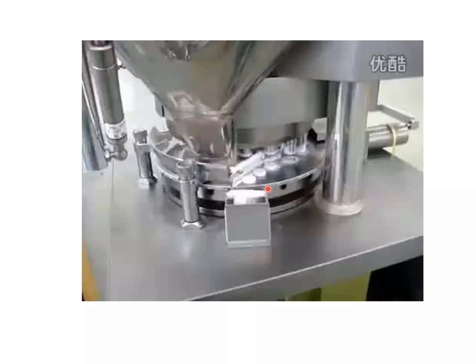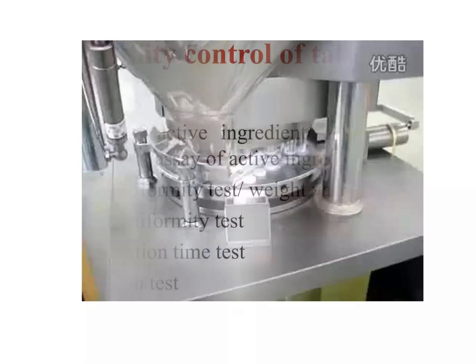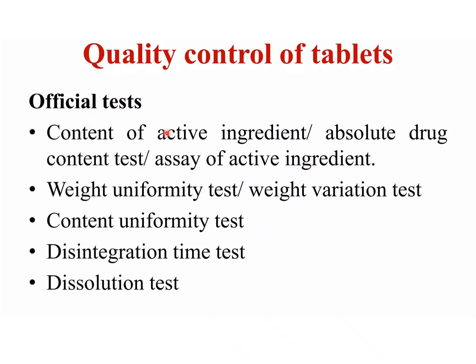So this is a compression machine. After the compression, we conduct a number of quality control tests for tablets. Here are the official tests: content of active ingredient, absolute drug content test of active ingredient, weight uniformity test or weight variation test, content uniformity test, disintegration time test, dissolution test.